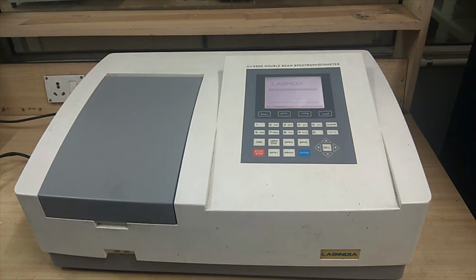So throughout this measurement, the measurements are done with a reference point that is set into the spectrophotometer for the measurement process, and similarly later on for analysis.